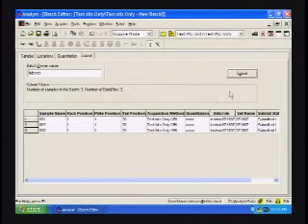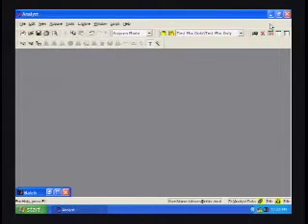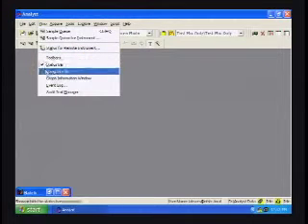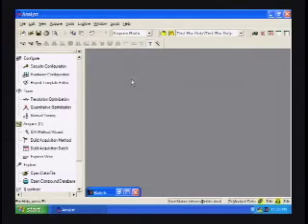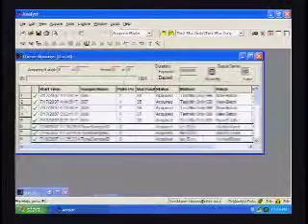So at this point, the sample should have been submitted to the, what is called the queue. Let's bring back up the navigation bar. The queue is a screen that lets you see what's going on with the instrument. What samples have been submitted, what samples are in line to be submitted. As well as what point the particular run that you're in, where it resides. So let's make things easier. Get rid of this navigation bar.